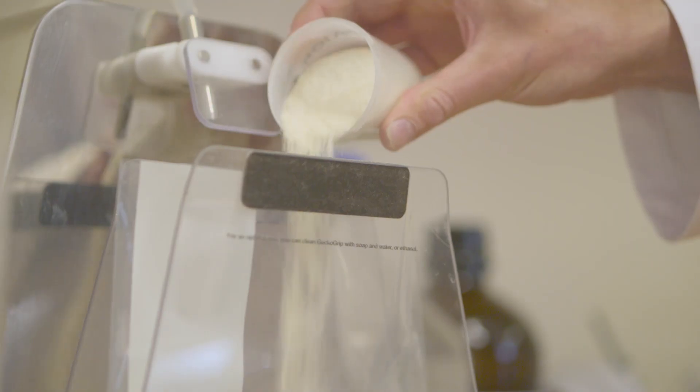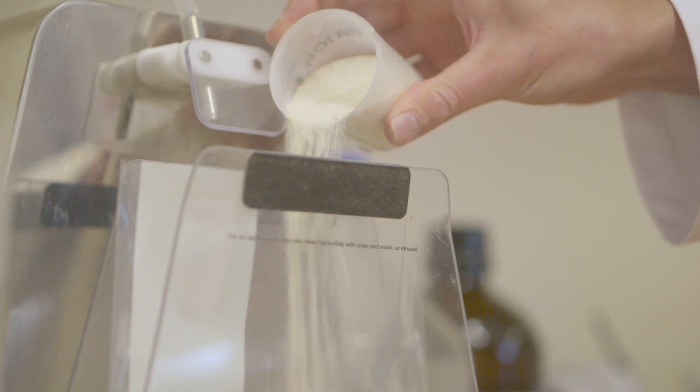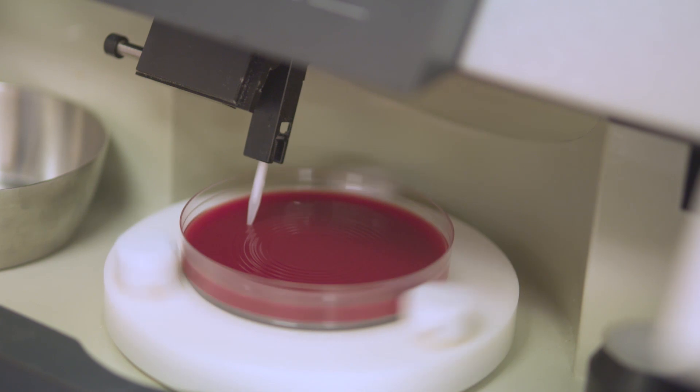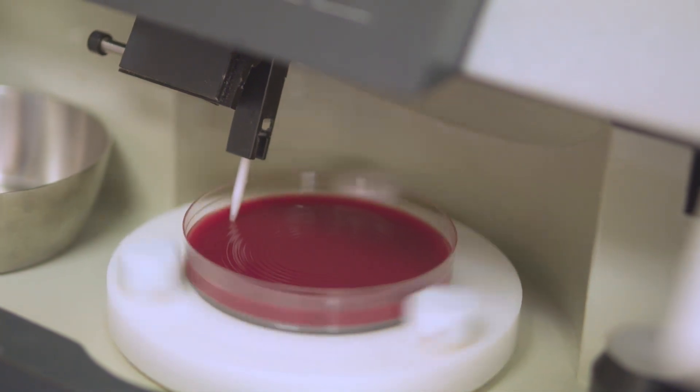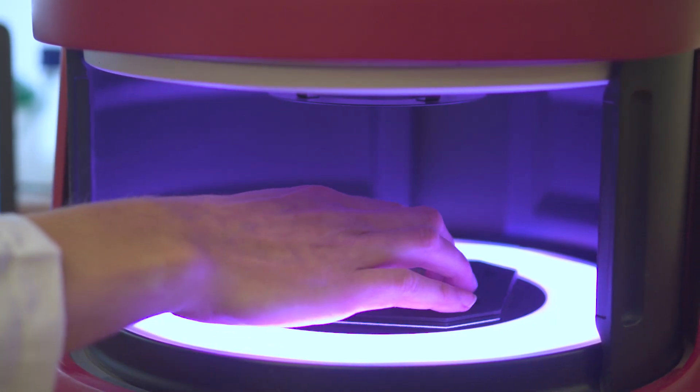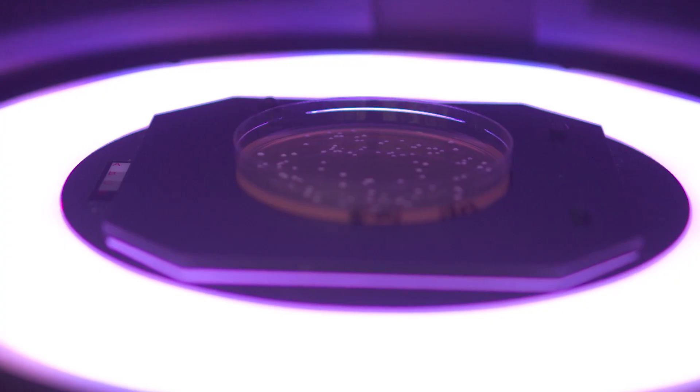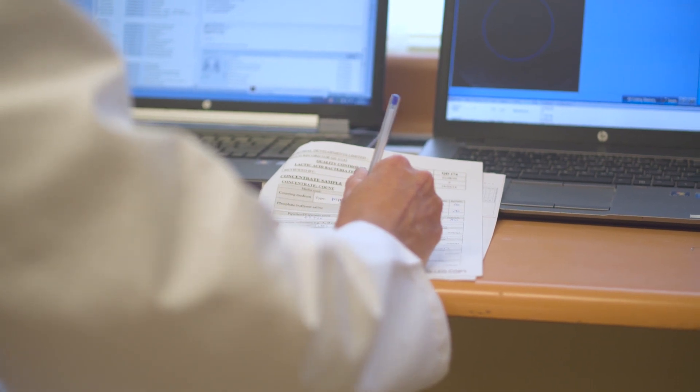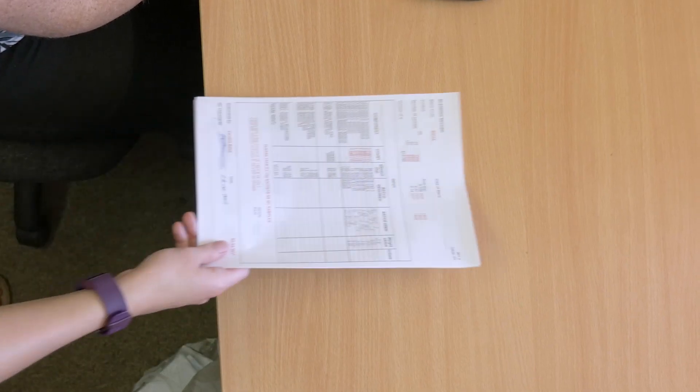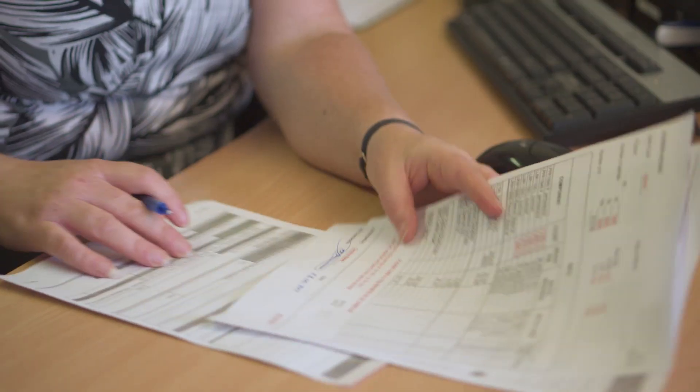Once filled, the sachets are classed as work in progress. This allows the final product to be rigorously quality control checked to ensure each bacterium and enzymes are at specification. We also check for dissolvability and flowability. Only after quality control has released each batch can the sachet be labeled and boxed, then quality control checked one final time before delivery to the customer.